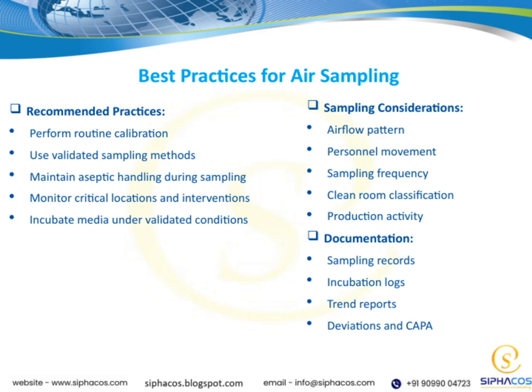Sampling frequency should be carefully planned. Too infrequent, and we might miss issues. Too frequent, and it could be inefficient. The clean room classification guides us on the acceptable levels of particulate matter, helping us determine the appropriate sampling strategy.